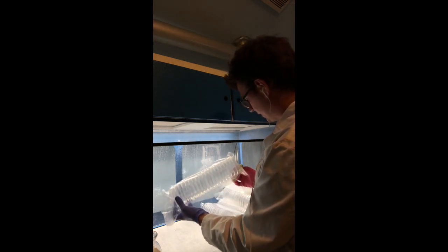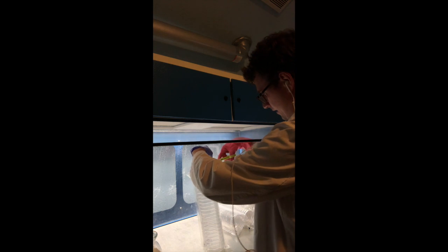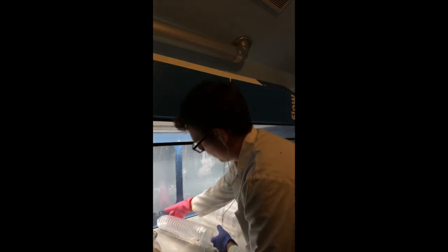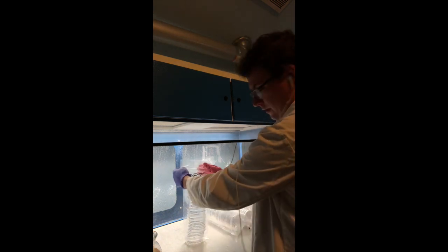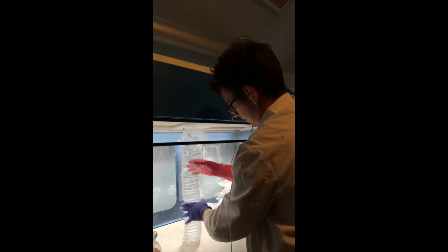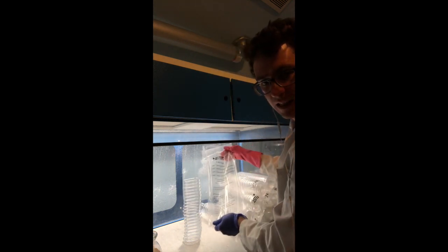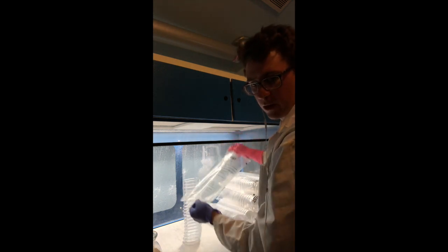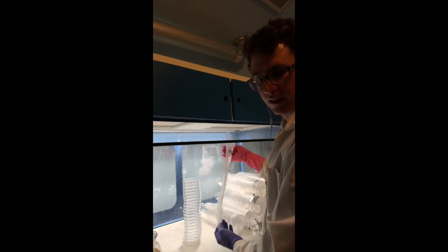So when I'm opening these, I'm just looking for the bottom of the plate so that when I cut this open, I will be stacking these plates. And then you just kind of peel off. And then I always save these sleeves just to be a little bit eco-friendly. If you cut it right near the seam, you can heat seal them and then throw them back in the box. And they're just a good way to, you know, save the earth.